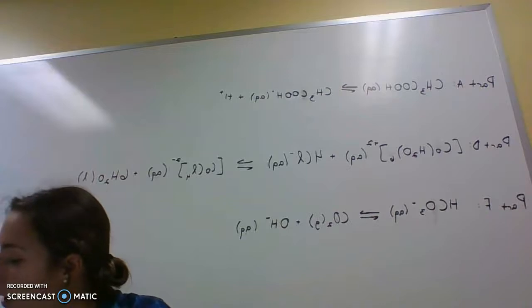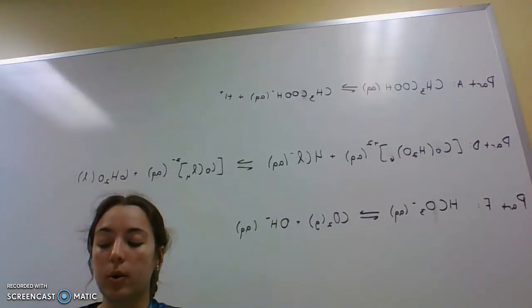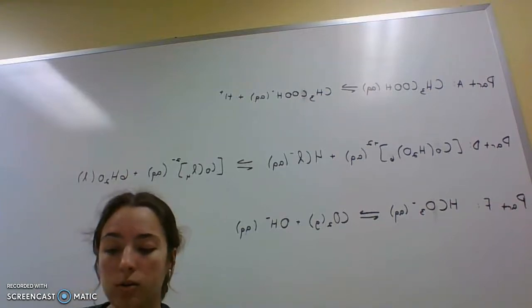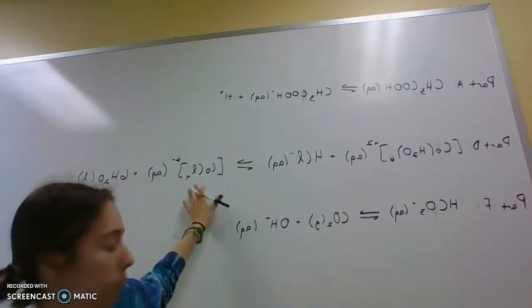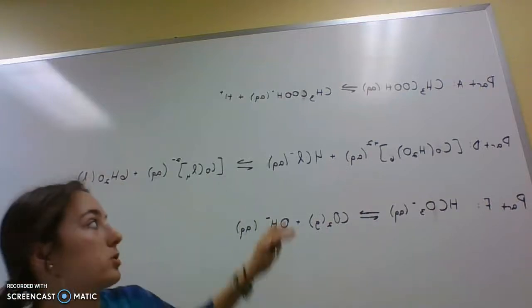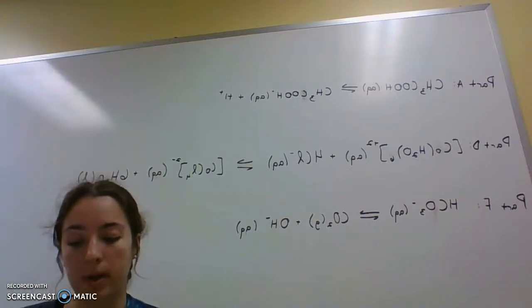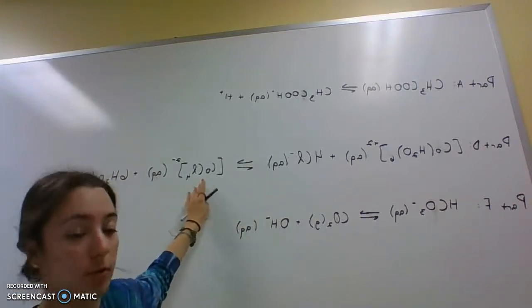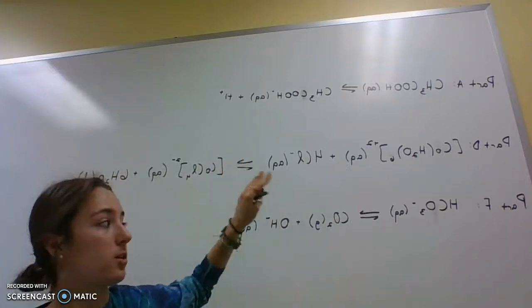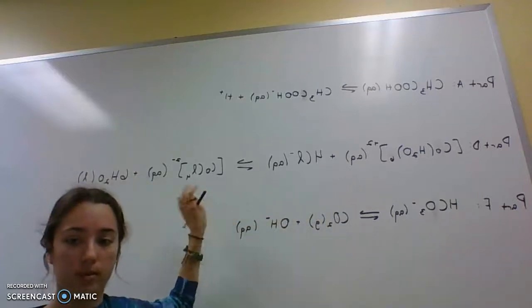So the next part was explain the color change that occurs when hydrochloric acid was added. In this part of the reaction, hydrochloric acid was the stress, and when adding the hydrochloric acid, the reaction turned blue. So this is a shift to the right or towards the product side. And our observation supported this with the equation because the ion CoCl4 2 minus is blue. So when adding that stressor, Le Chatelier said it would shift right. And since this is the blue side, it supported that because it moved in the same direction.